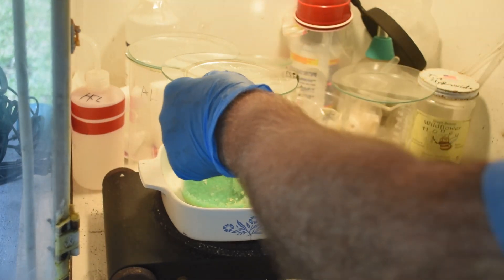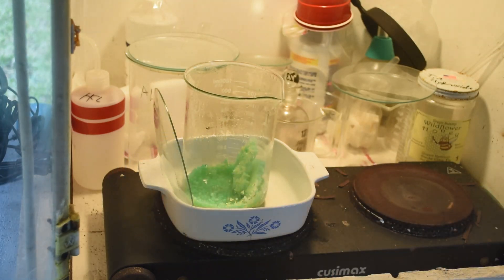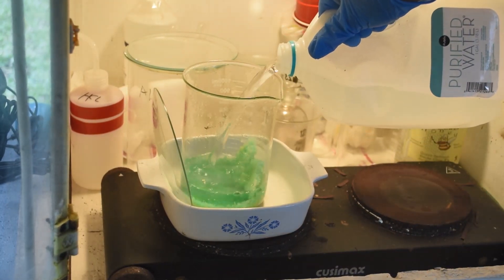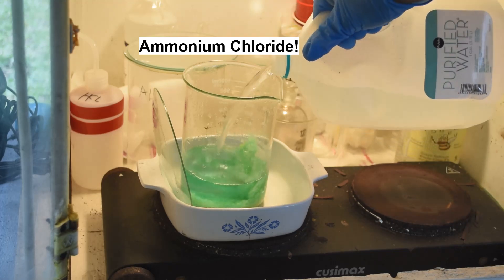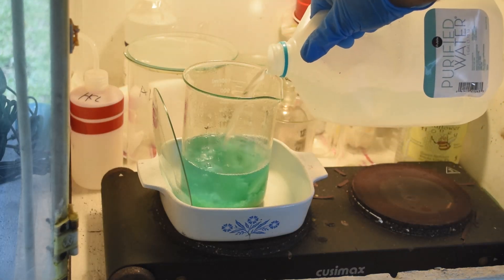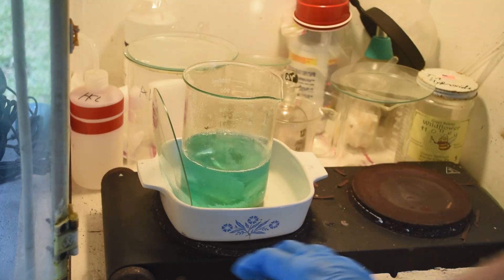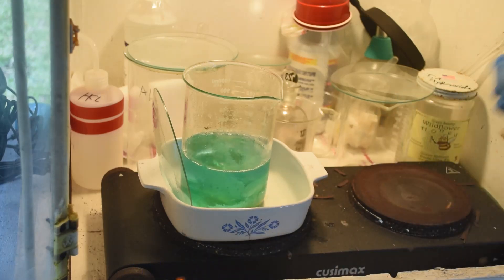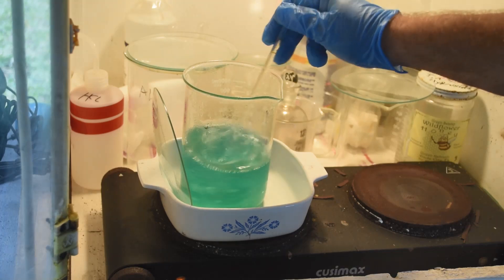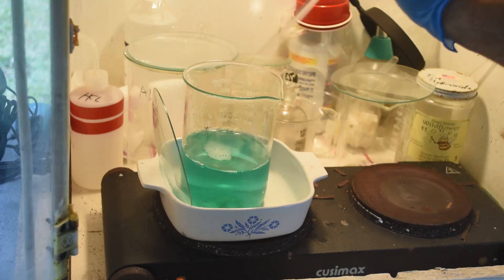Let me get some purified water on this and we'll see if we can get these crystals to go back into solution. I suspect — but don't know for sure — that they are mostly ammonium chloride, in which case they should dissolve pretty well in four or five hundred milliliters of water. It looks like it's dissolving pretty thoroughly already — I haven't even put any heat to it or stirred it up. Oh yeah, this stuff's all dissolving nicely.